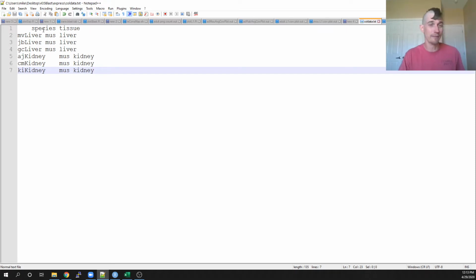So I have a species attribute, and I have a tissue attribute. I think I could reduce it even further to just tissue, but say I could develop a matrix that's full of multiple species and multiple tissues. I can at least define it that way.